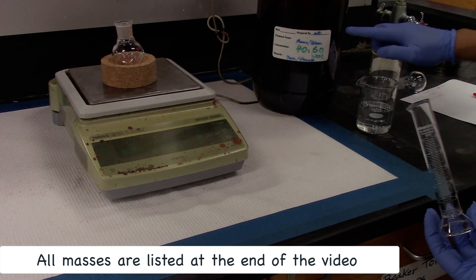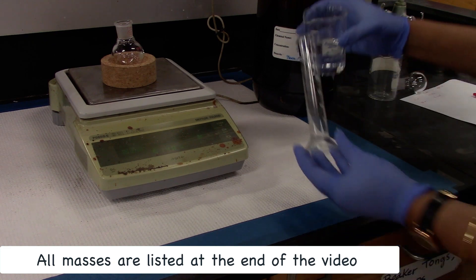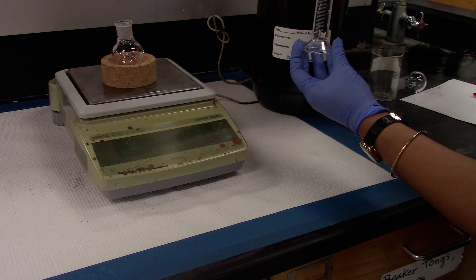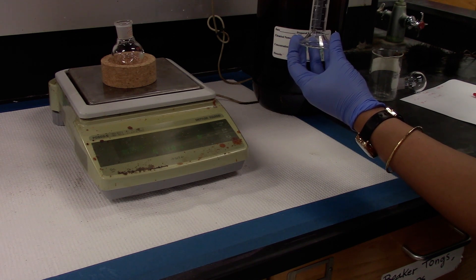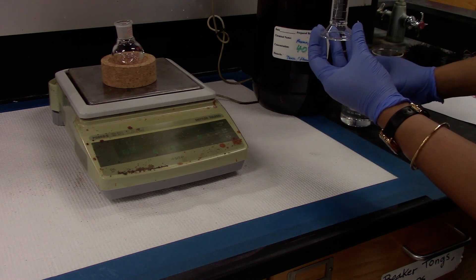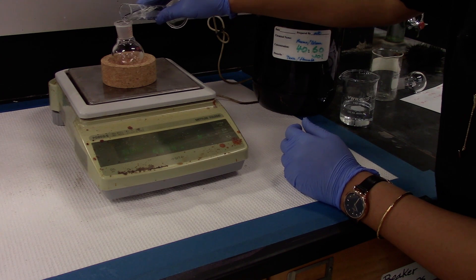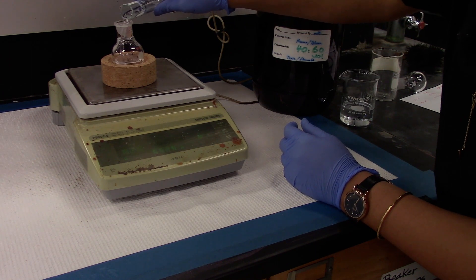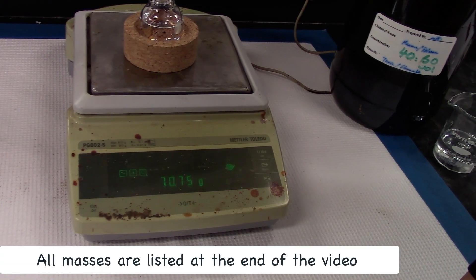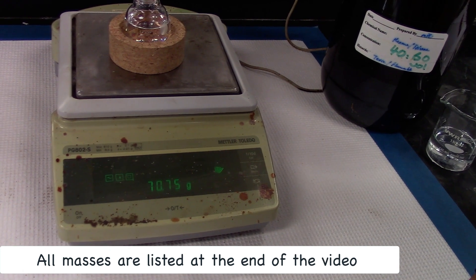We are using a hexane-toluene mixture, a 40-60% mixture. I will be adding 25 ml using a graduated cylinder and add it to the 50 ml round bottom. Record the mass of the round bottom flask with the 25 ml mixture.